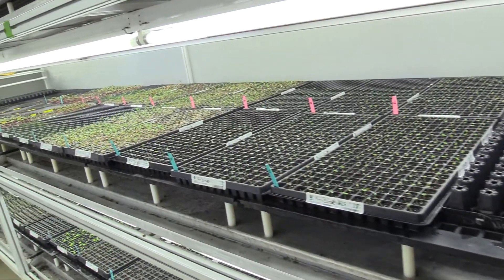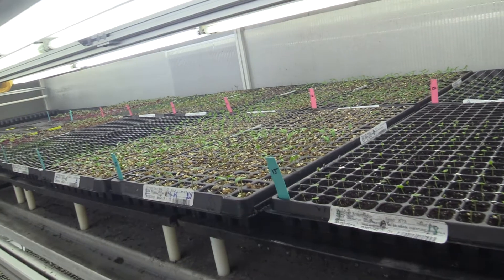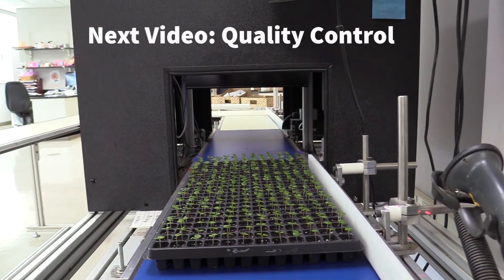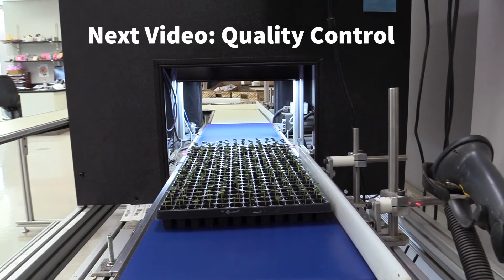How long may something sit in here? Well, the shortest crop time we have is about six days, and the longest is about 28 days. Once it's ready, we take the flats and run them through our Seaview machine — we'll show you that in a minute.